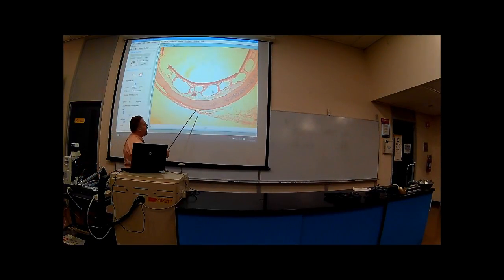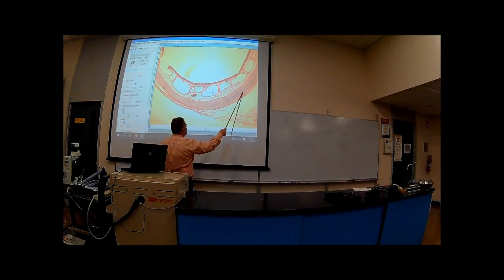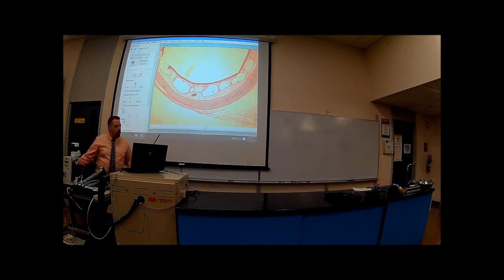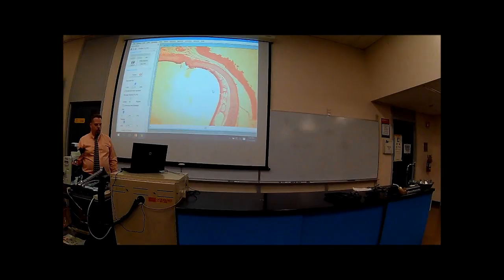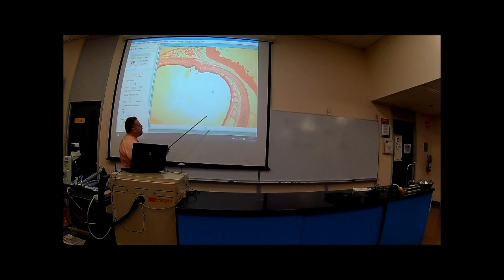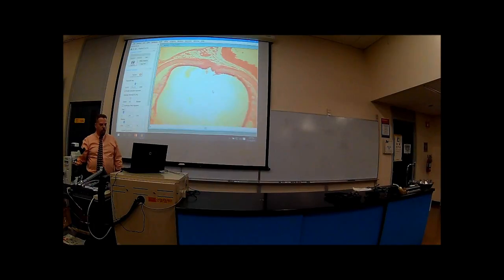So again, this is going to be hyaline cartilage all here. It's almost making a ring around this whole thing. But let's just pan this. Follow this over here, and I'm going to move the slide that way. Following it up, up, up, up. And then it goes this way, tapers off, and ends here. A space or gap, and then it tapers back this way, all the way around. Okay?